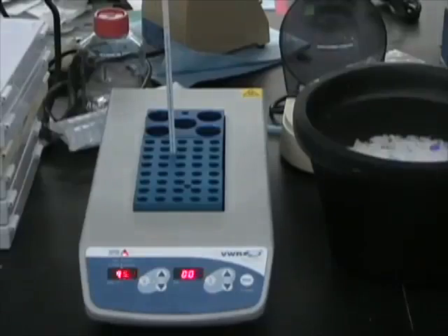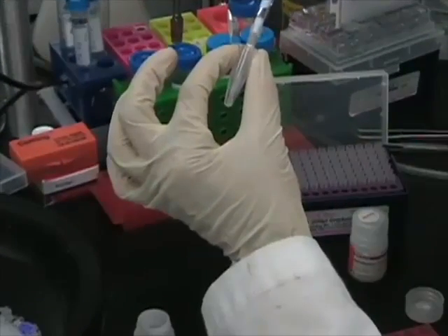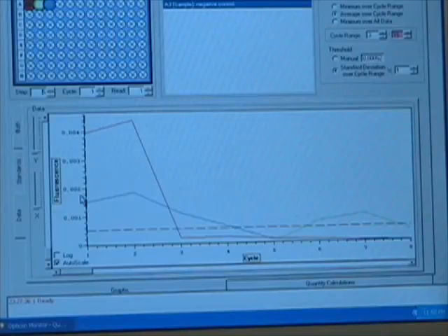This protocol involves a quick tail digestion and DNA extraction, and then a quick neutralization step. And we use the extracted DNA in a real-time PCR where we can monitor our PCR amplicons. So if you're ready, let's get started.